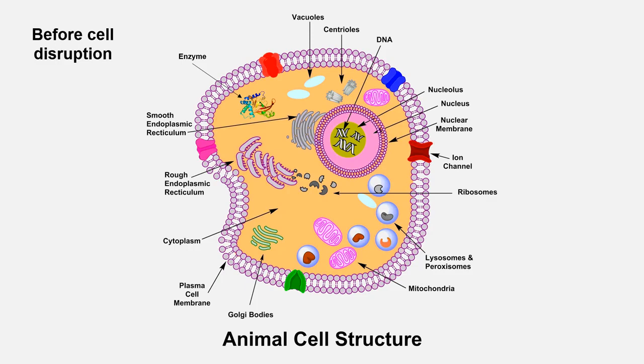In this case, we don't need to open the cell. We don't need to disrupt the cells as the product is outside the cell. In most cases, the interesting molecules accumulate inside the cell or are associated with other molecules as a complex or integrated with the cell wall. To get these molecules, first we need to open the cell or destroy the cell wall to release these molecules.